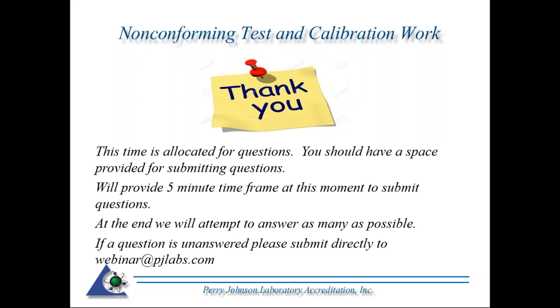institute non-conforming work, i.e. quality control checks, intermediate checks being out, instruments being used when they were actually out of calibration, technicians not following procedures.